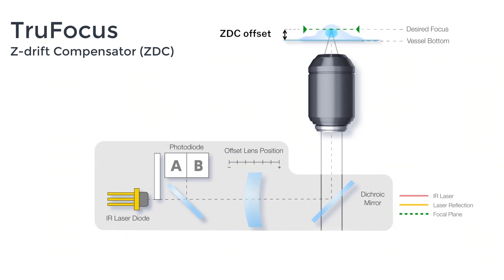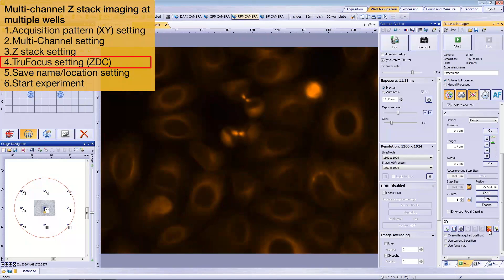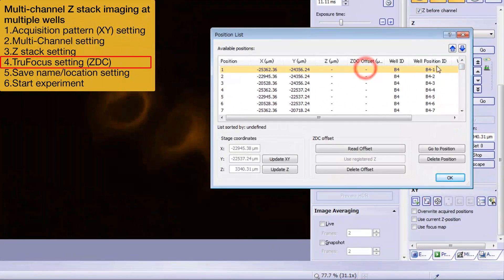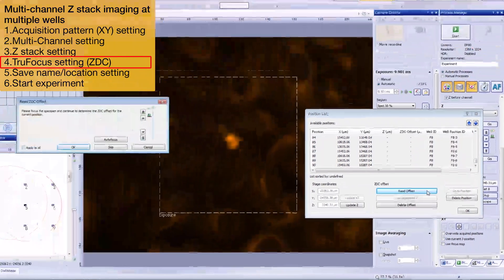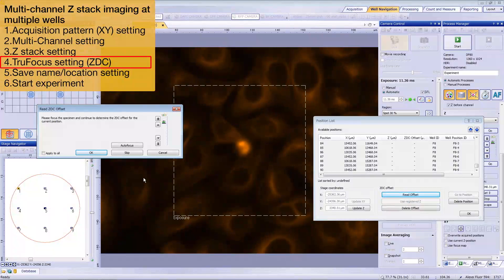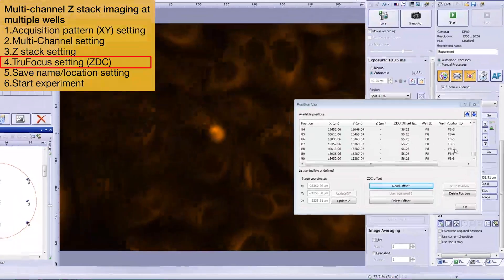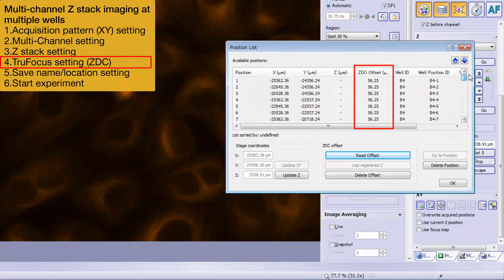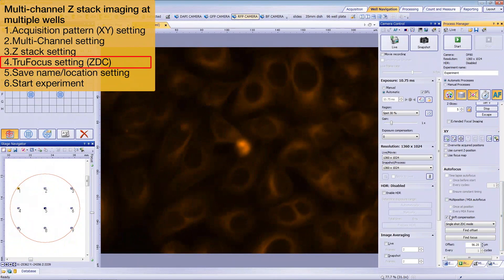We can register the same Z-Drift offset at several positions, since we expect the cells to be captured at almost the same distance from the vessel bottom. Open the position list and select the positions that have the same offset value. In this example, we'll select them all. Click Read Offset — live starts automatically so that you can find the focus position. Once you've done that, check Apply to All and then click OK. Make sure that the Z-Drift compensation offset was registered. You can also register different offsets for different wells for more accurate focus. Click the AF icon and check Z-Drift Compensation to activate TrueFocus during the experiment.